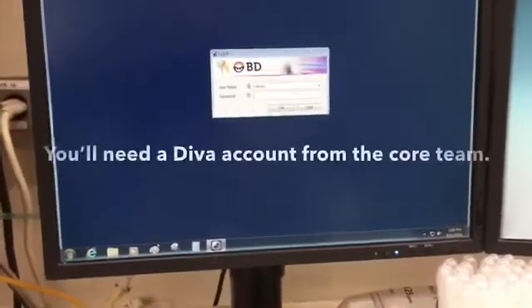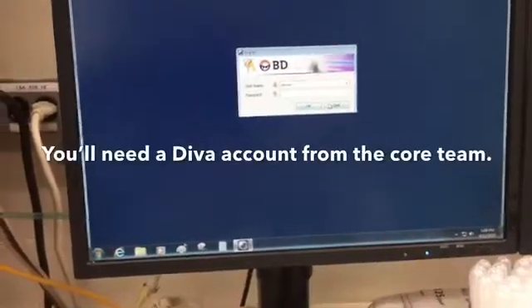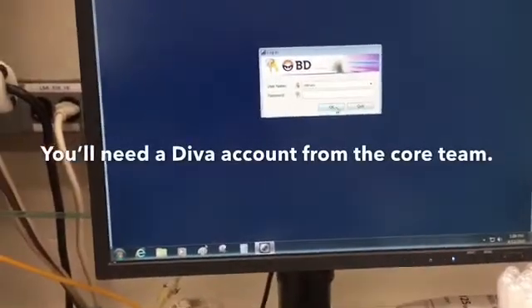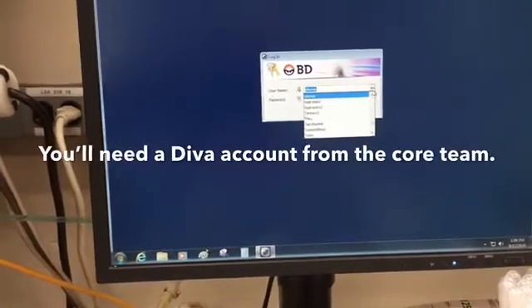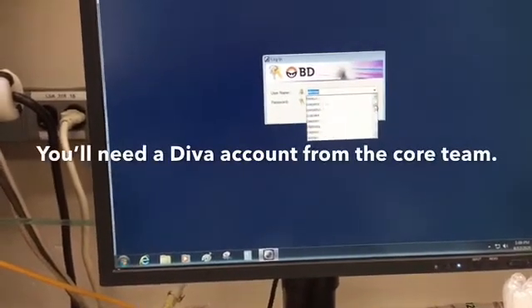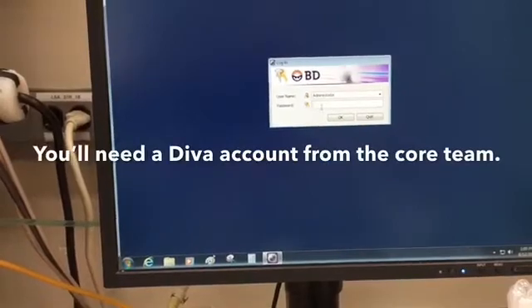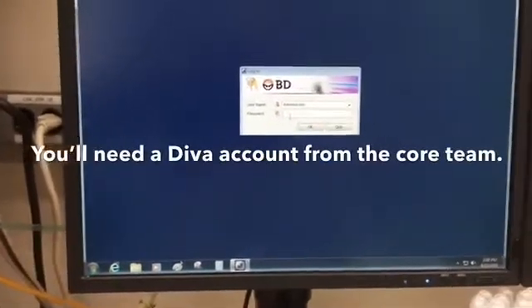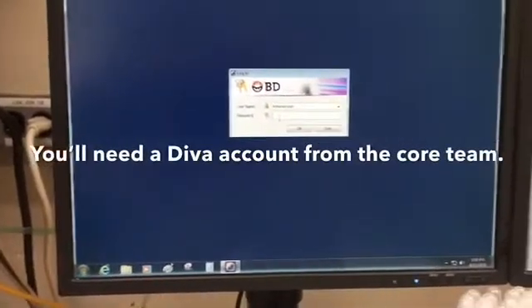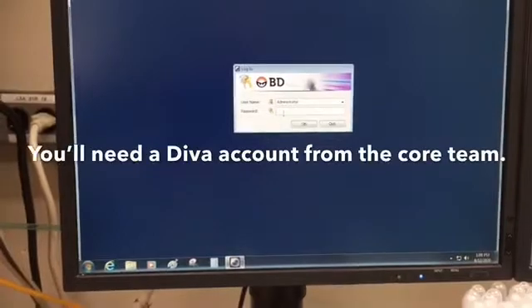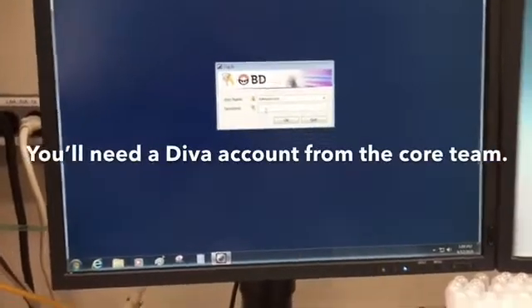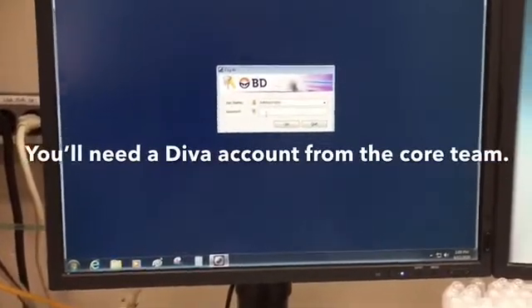Once the splash screen comes up for Diva software, you'll see that all the users have their own unique login. I'm going to log in as admin, but once you're in the system and have access rights that we grant, you'll have your own unique login and password to use here. So Diva will launch.